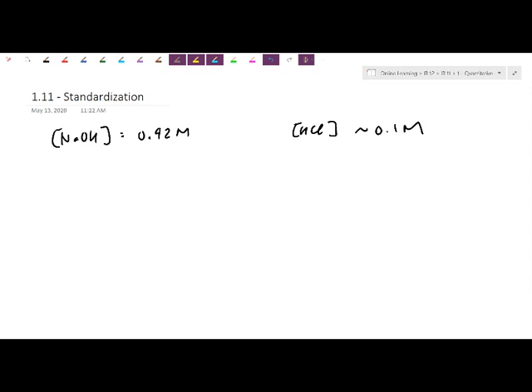So what you saw is we actually did a dilution calculation. The appropriate way to do dilution here is I started off with a solution. You notice I took a burette. The first time I did a dilution, remember I did that mix up and like, oops, I forgot the starting initial volume or whatnot. I'm just going to do it with the second time because that's where we got the rest of the numbers from.